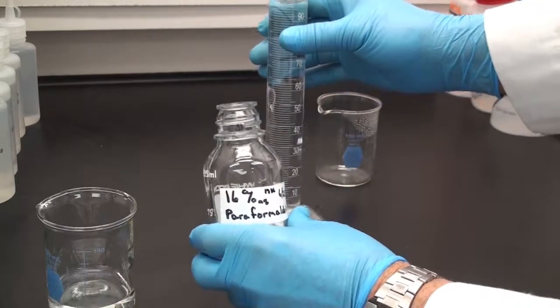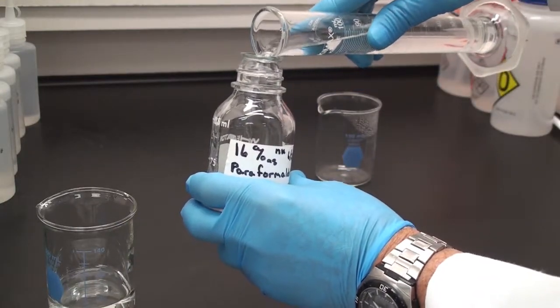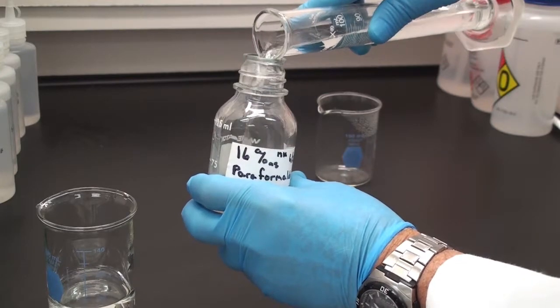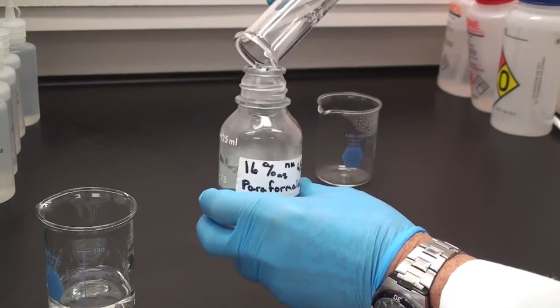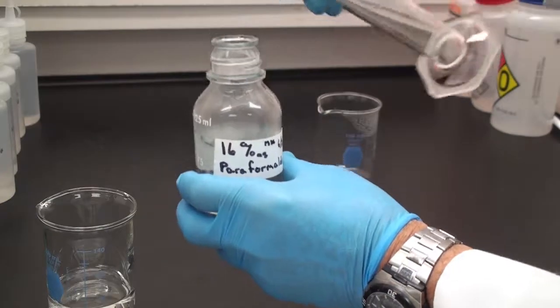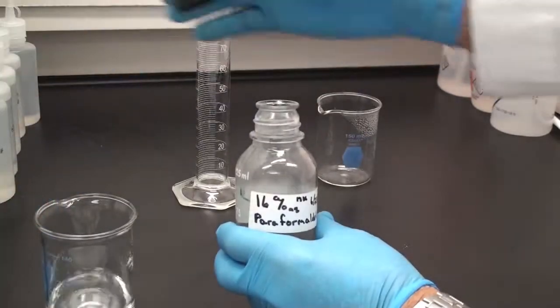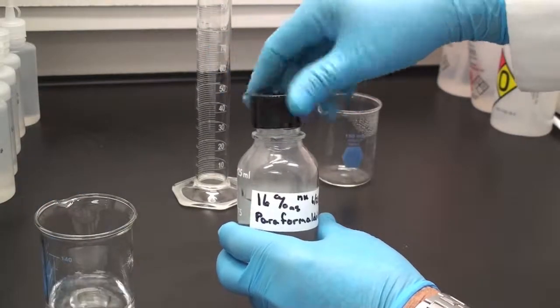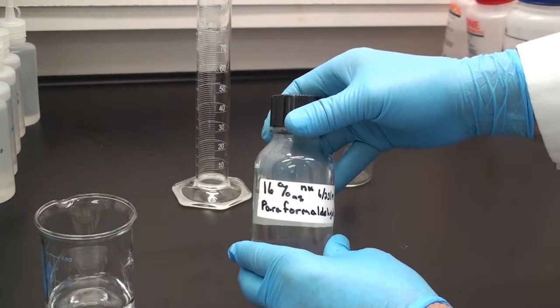So as I put that into my labeled bottle, 16% paraformaldehyde, that's a stock solution. Now you can use that to make Karnovsky's fixative or a fixative for labeling that you might use without glutaraldehyde. Straightforward and not too bad. Thank you very much.